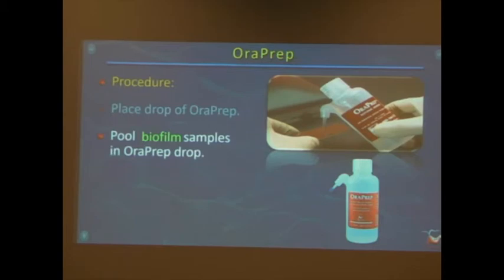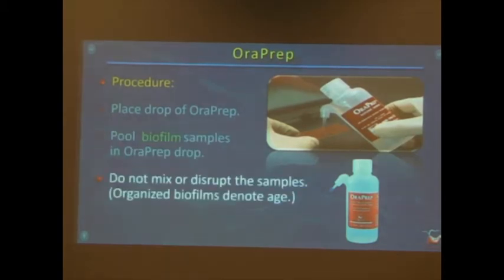I'm warning you: don't disrupt the samples. I've noticed a tendency of people when they make the samples to want to kind of scrub it into the drop, you know, mix master it. Don't do that because there's information to be had by the organization of the samples on the slide.